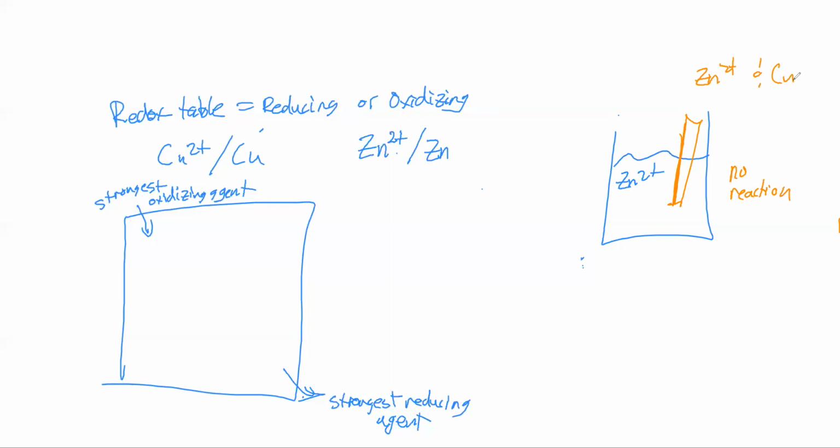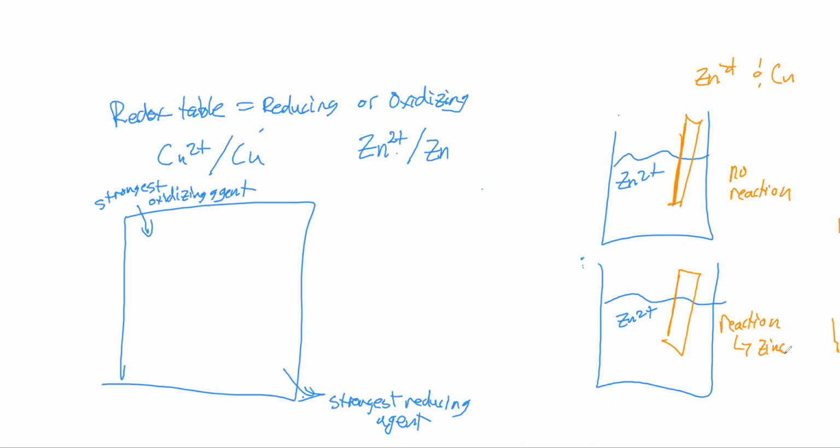If we did that same thing with the zinc 2+, and this time there was a reaction, zinc came out, right?